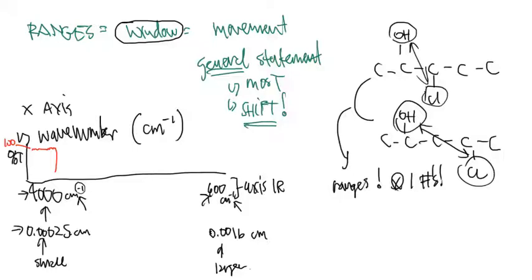And then as the infrared spectrometer scans through the wave numbers, it comes back up, because now the molecule's not interested in those workout days, and it goes back to 100% transmittance. Then we might see another spike. The molecule liked it that day, and it comes back up. And then another spike, and then it comes back up. And then maybe a couple of spikes back to back, and that's what we call our infrared spectrum. Okay? So percent transmittance on the y-axis and wave numbers on the x-axis.